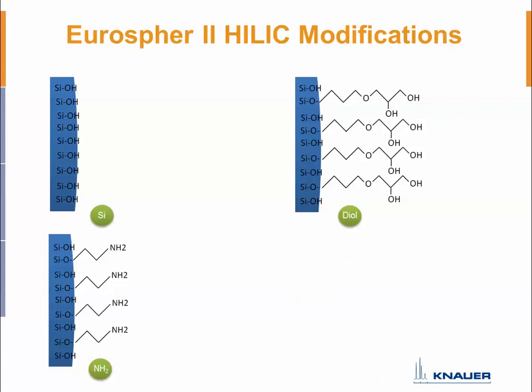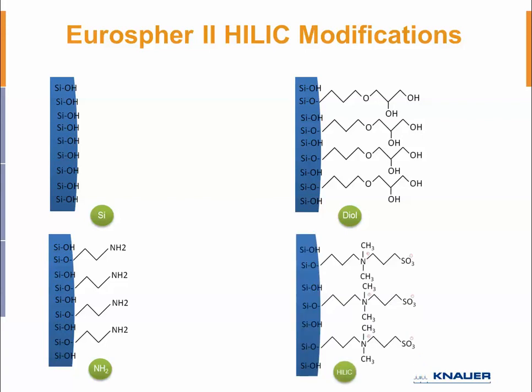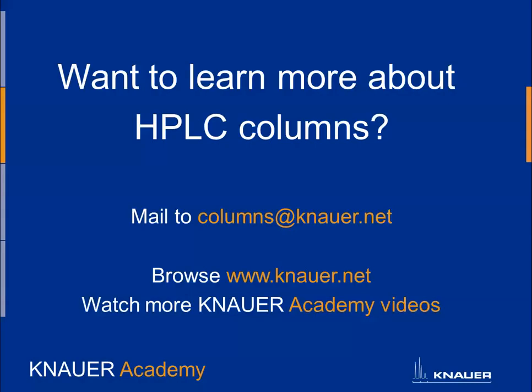And there are also HILIC columns, and you see here you use nearly the same columns. HILIC mode is really done on the same columns as normal phase, but with a completely different eluent, because you use here the hydrophilic interactions of the analytes with the phase and with an aqueous layer on your phase. So these columns, same stationary phase, completely different mode in HILIC. And there's also a special phase we offer, a zwitterionic phase in the HILIC mode.